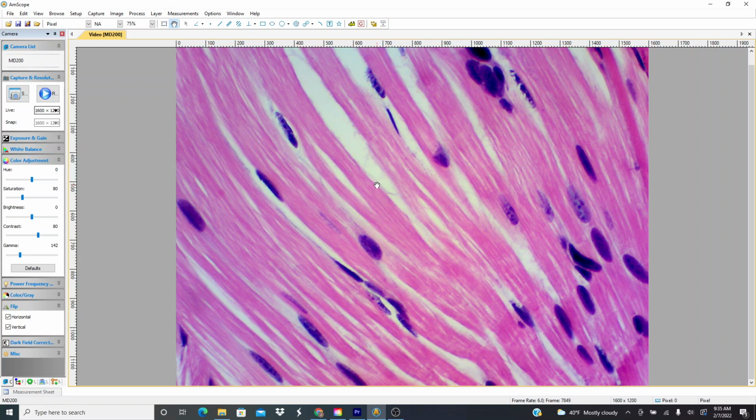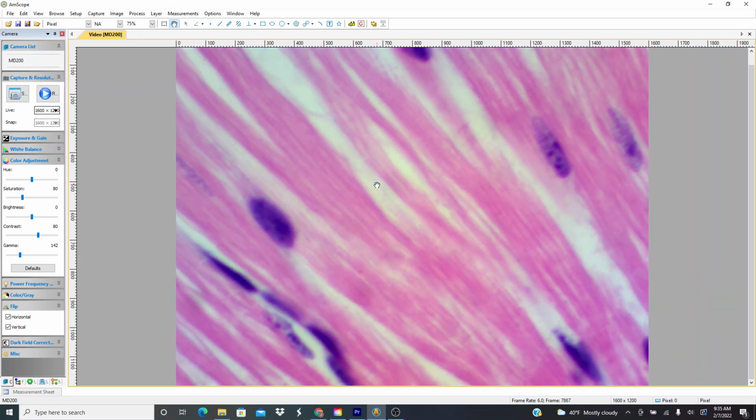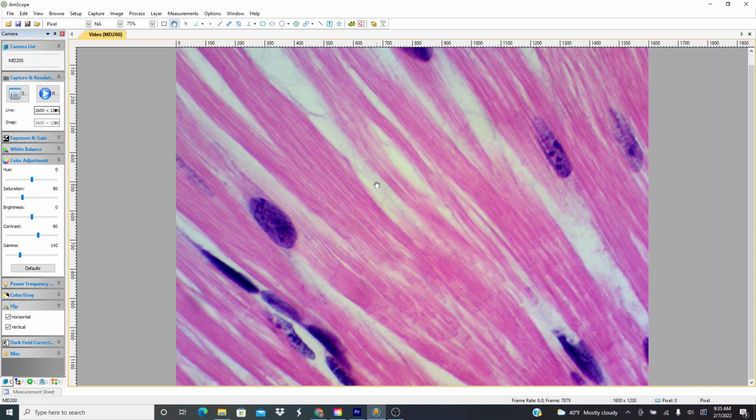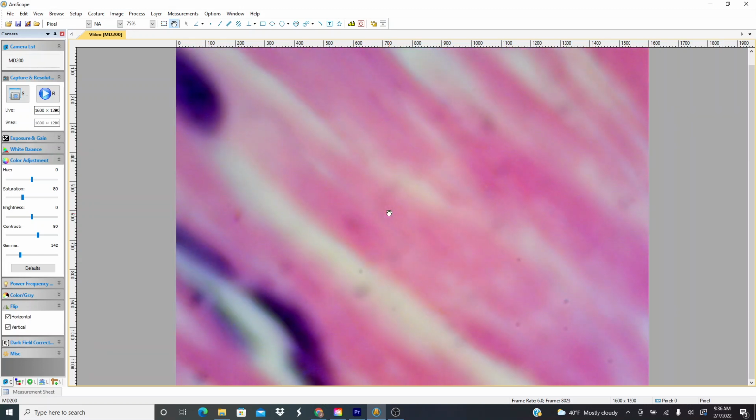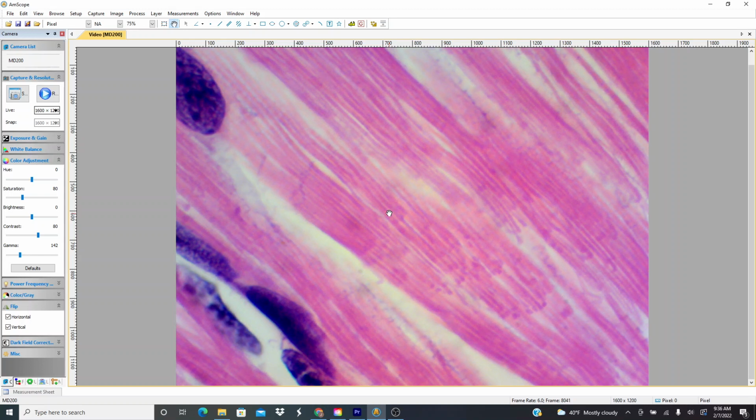Let's kind of focus here. Let's go on the highest power. You can see this pattern. It's kind of subtle. It's sort of like little lines kind of going in this direction. Let me get my mouse. You can kind of see this pattern right there. Cross banding on the skeletal muscle. It's pretty cool. Let me see if we can get it. Wow.